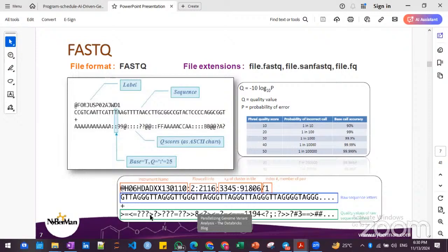We are trying to understand these formats because if there is an error, we should not conclude that the tool is not working. There must be a problem that your data is not correct. So you need to be sure that the data you are using is good.